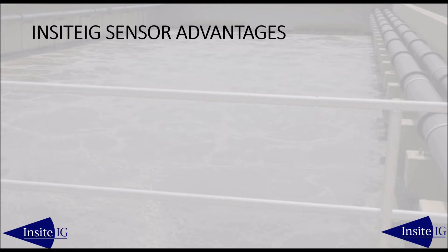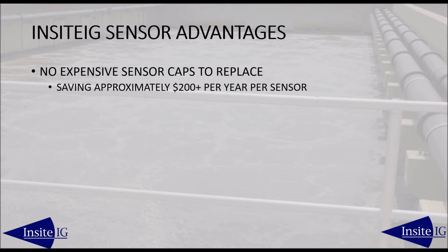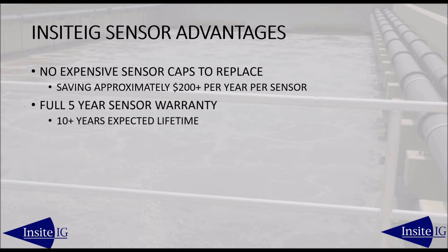The main advantages of the unique Insight DO sensor are: no sensor caps to replace, saving over $1,000 during the life of the sensor. Insight is the only optical DO sensor manufacturer that can make this claim. There is a full five-year sensor warranty, by far the best in the industry.